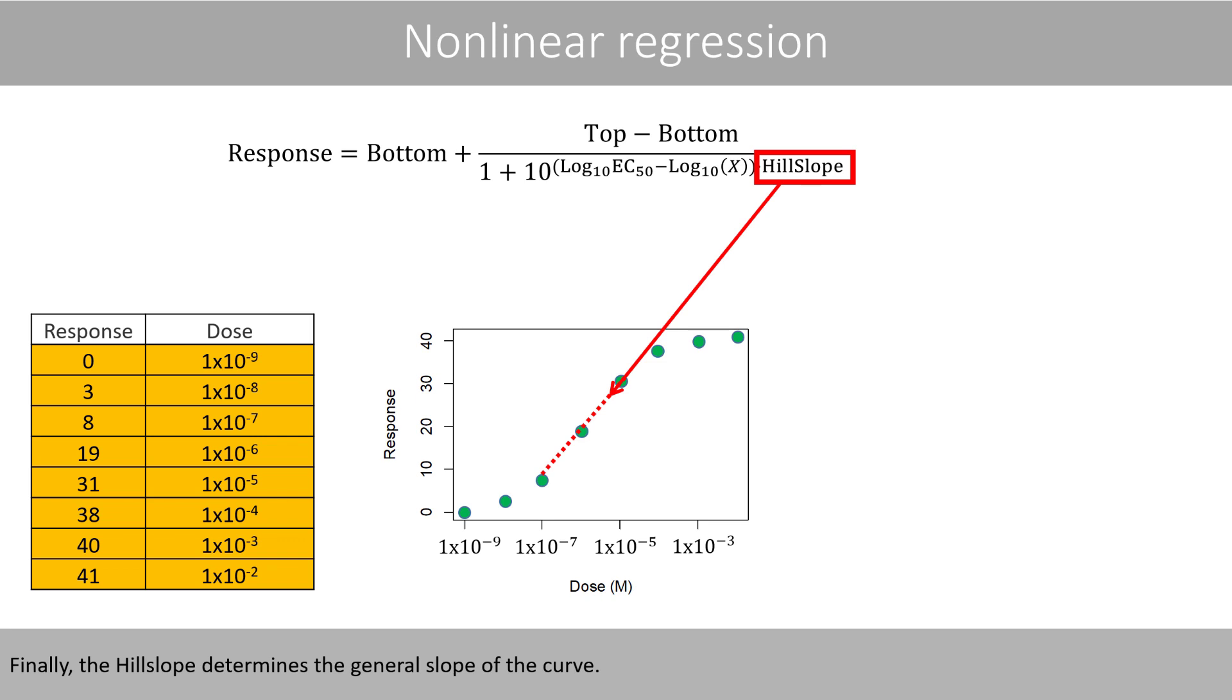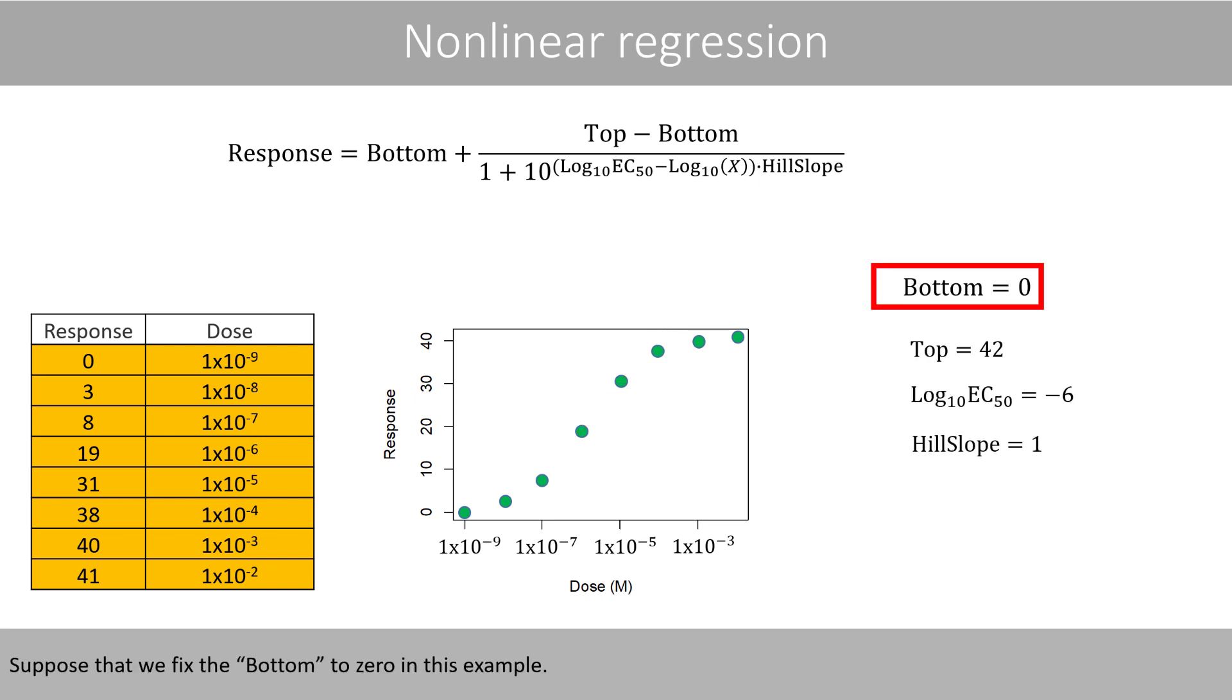Finally, the hill slope determines the general slope of the curve. Suppose that we fix the bottom to zero in this example. Our initial guess of the top could be set to 42, and log10 EC50 to negative 6, whereas an appropriate initial guess of the hill slope is usually 1 if the slope is positive.